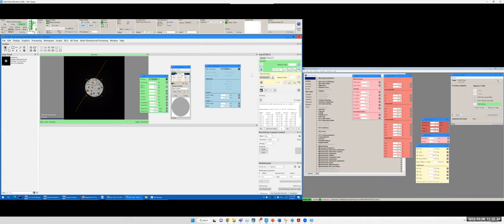Yeah, I will change to a higher convergence angle for measurement because I want to show you some atomic resolution images of the gold particles. Okay. So I did the fix twice. Normally when it's working perfectly, after two measurements it should be very good already.